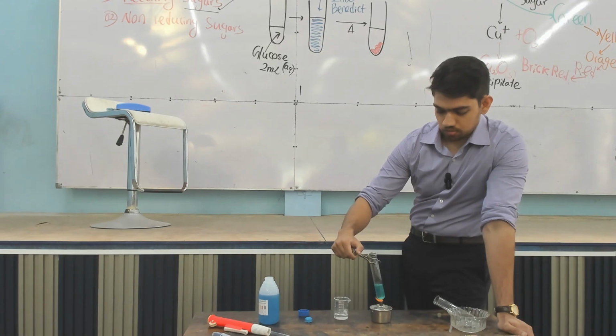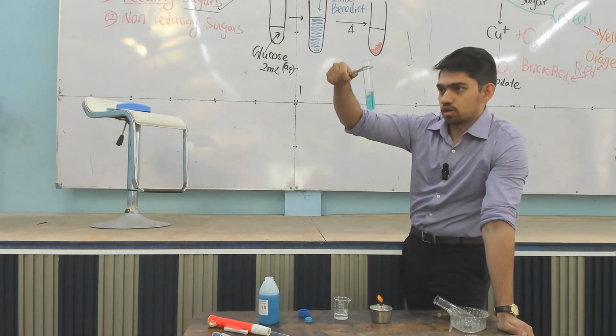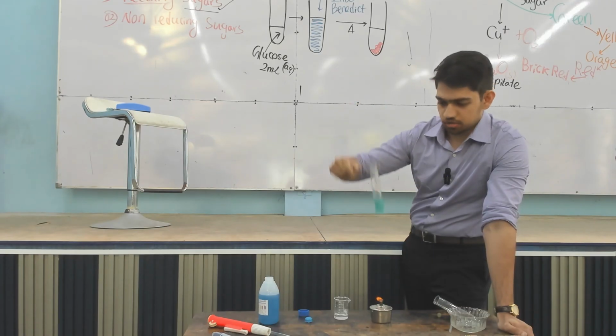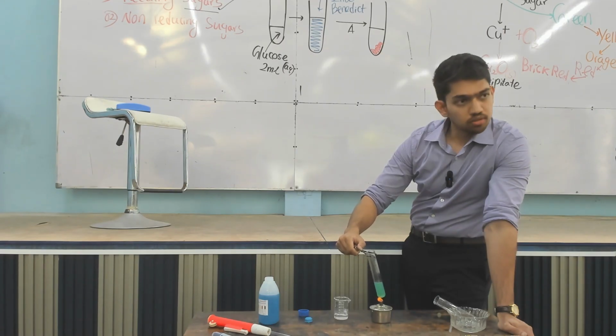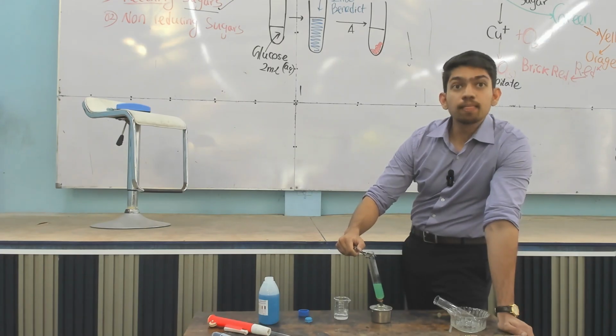Okay, so a Bunsen burner is able to provide a lot more heat because it's gas, no? You can see a small color change, right? Slightly becoming greenish. Can you see? It's a teal color, sort of green-blue. Now green, no?